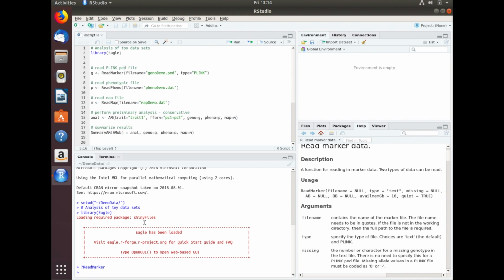If you've got a file that's just enormous, so half a terabyte in size or something, then this is going to take quite a bit of time to run through. But the good thing is it can handle data of any size. The other thing with this command also is it can handle data of 2 different formats. It can handle either PLINK ped files, which is a well-known format, or it can just handle straight ASCII text files. And as I said before, the main thing is make sure you don't put column headings in because that's just naughty.